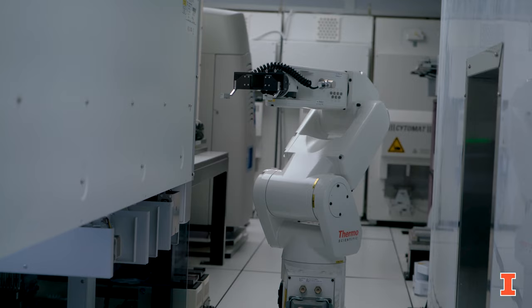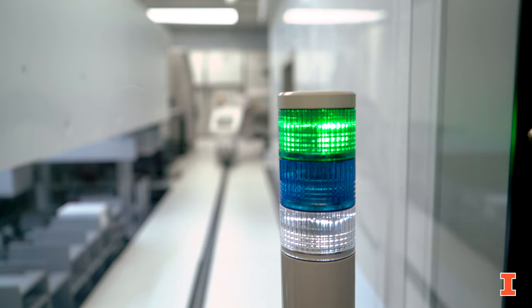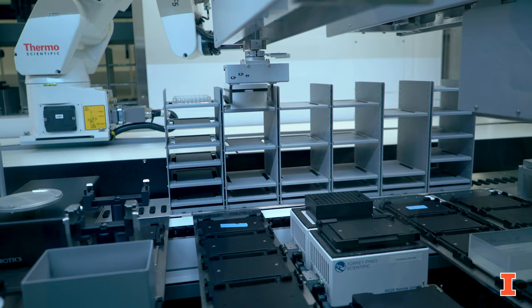I'm with Mason over here at the iBioFab, and he's going to tell us a little bit about a protocol that he's been working on today. Hey guys, I'm Mason. Today I'm going to show a simple protocol of transferring a plate to some of our equipment inside the iBioFab and doing a simple liquid handling transfer.